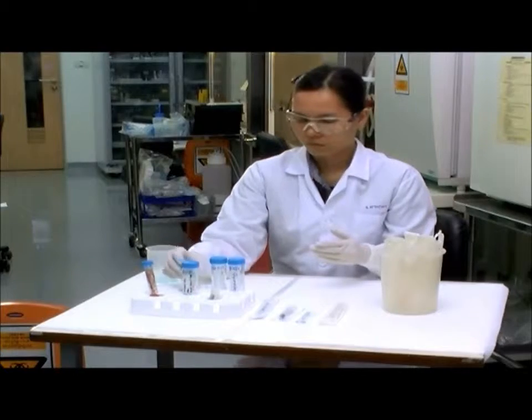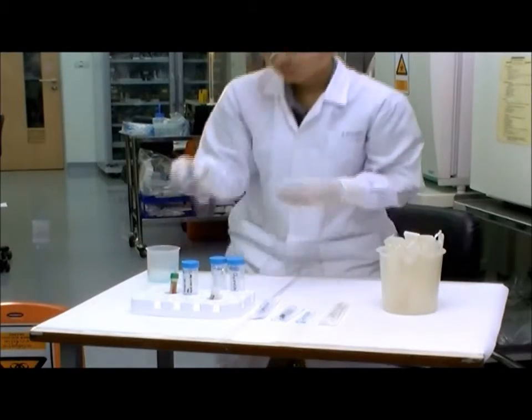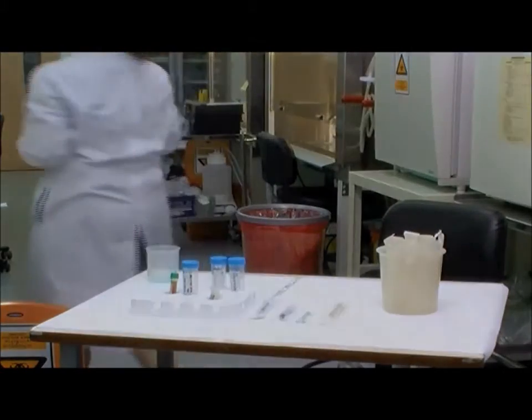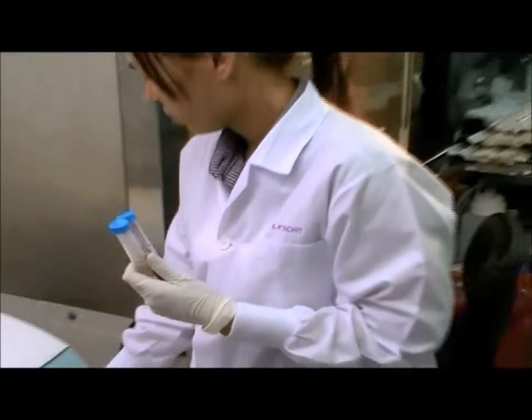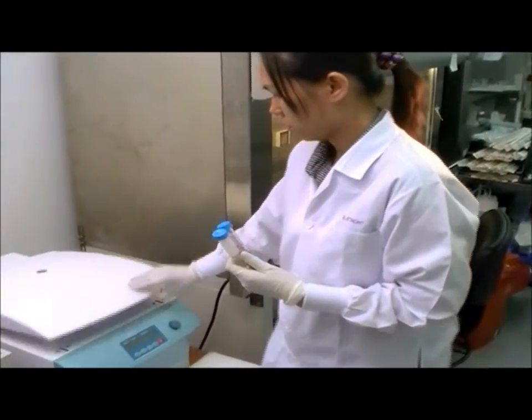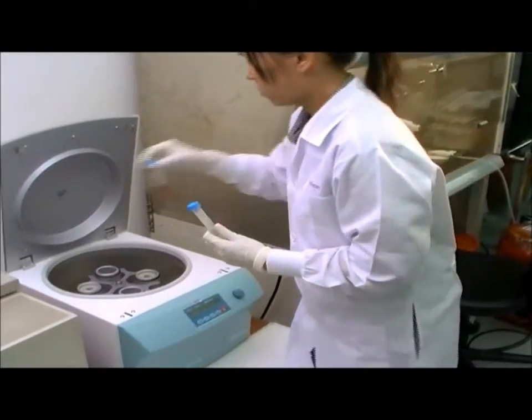Centrifuge the blood at 700 G's or RCF for 5 minutes. If a refrigerated centrifuge is available, perform this and all subsequent centrifugation steps at 4 degrees centigrade. Ensure that the tubes are balanced before centrifugation.